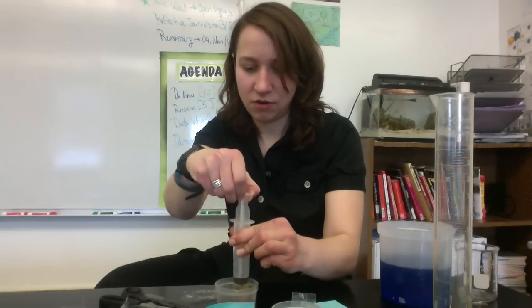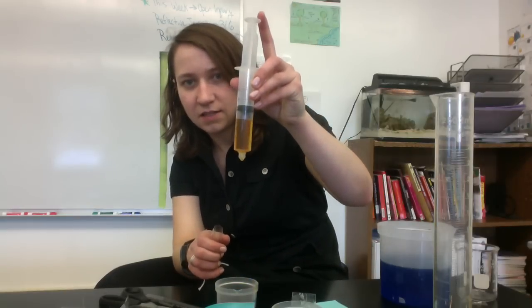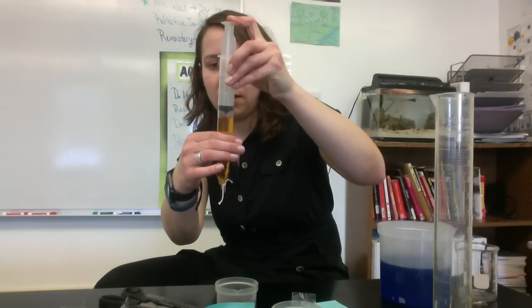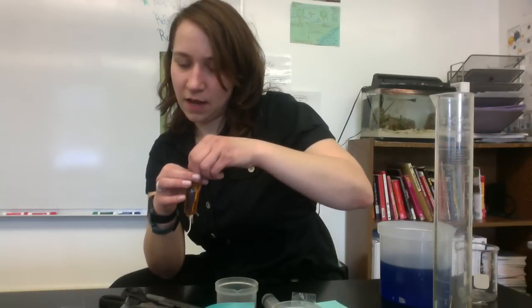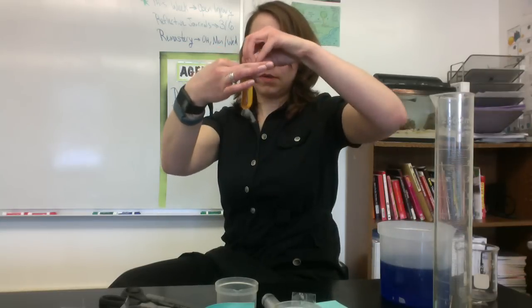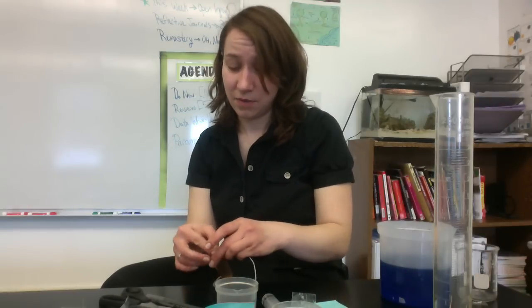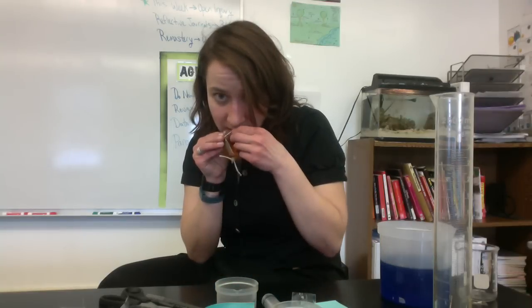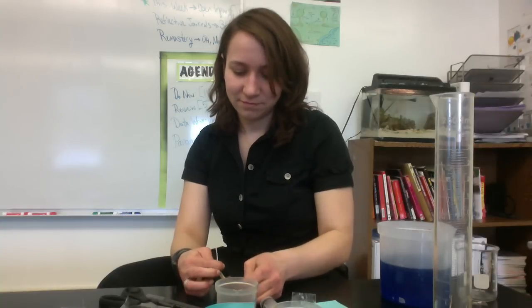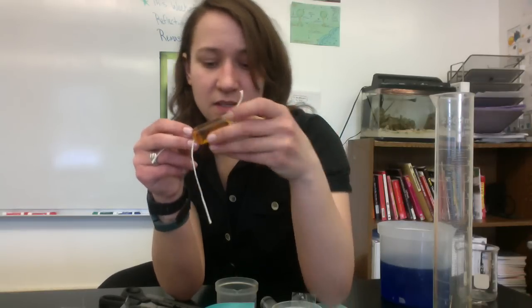You measure 15 mL using one of these syringes — draw it up until there's 15 mL inside the syringe — and then you inject that into your bag. Once you've done that, you're going to take another piece of string and twist off the end a little bit. This is something you're probably going to want two people for, because it's definitely tricky with one. Don't use your mouth — use two people — and make this little artificial cell. Now I have a cell with my unknown liquid on the inside. I'm going to make four of these, so I'll have four artificial cells with 15 mL of my unknown liquid on the inside.